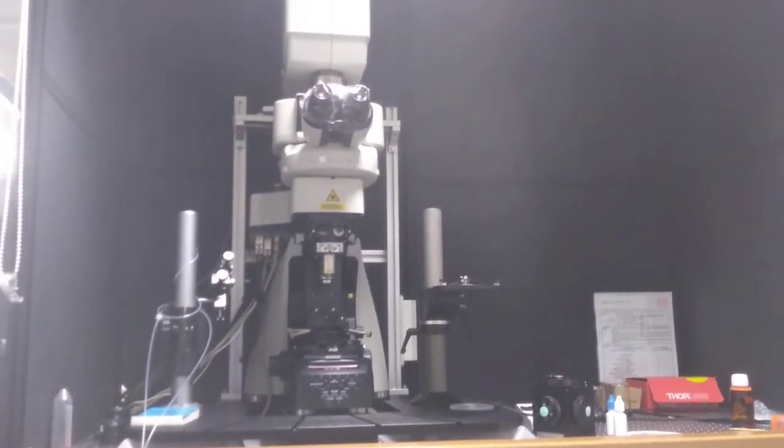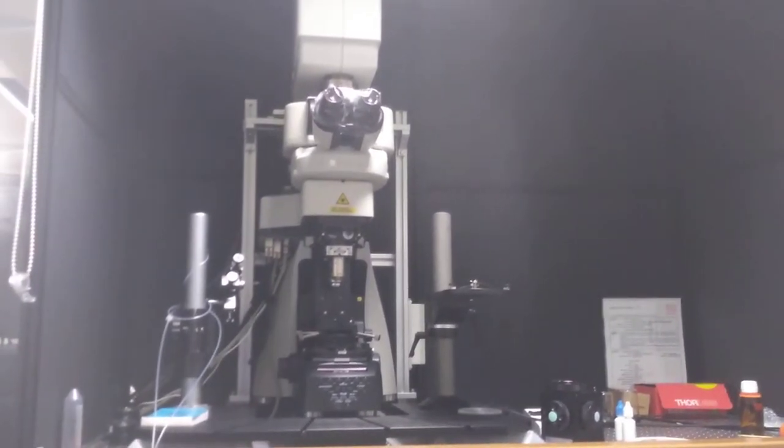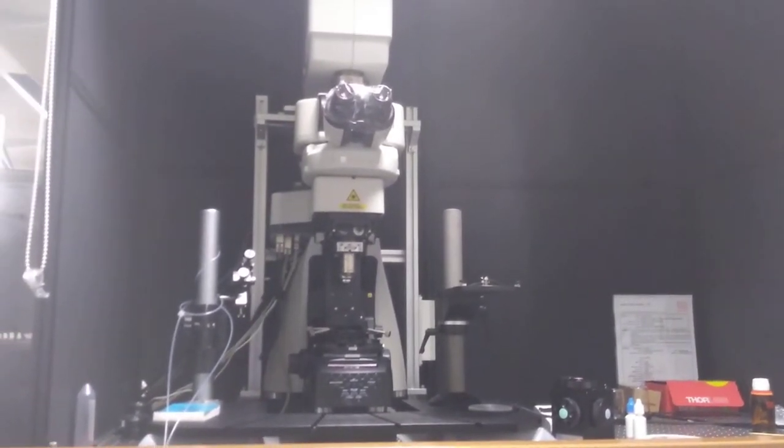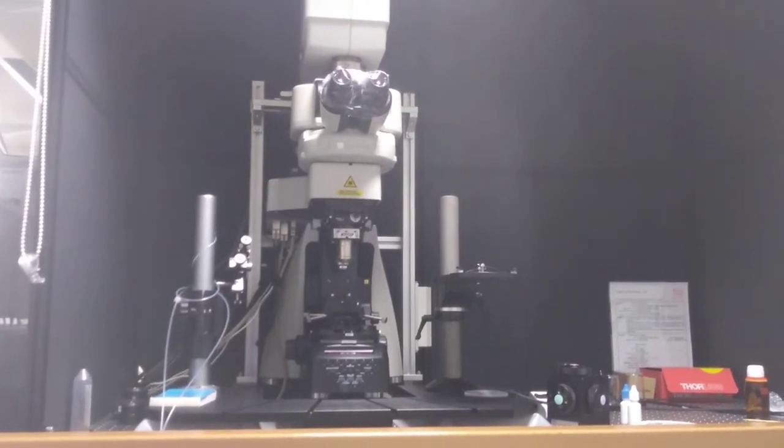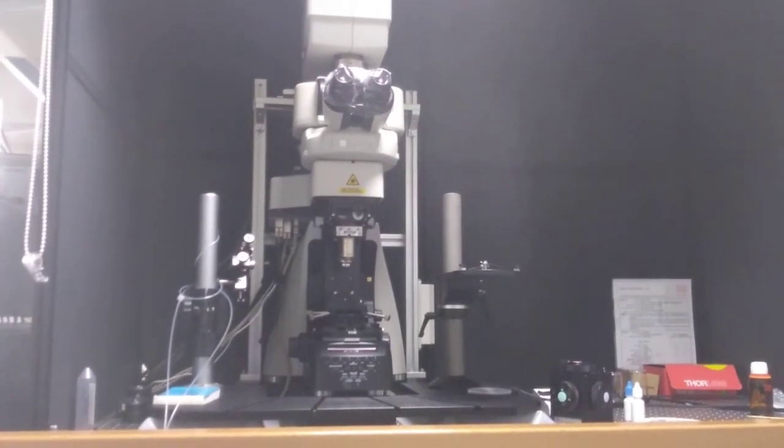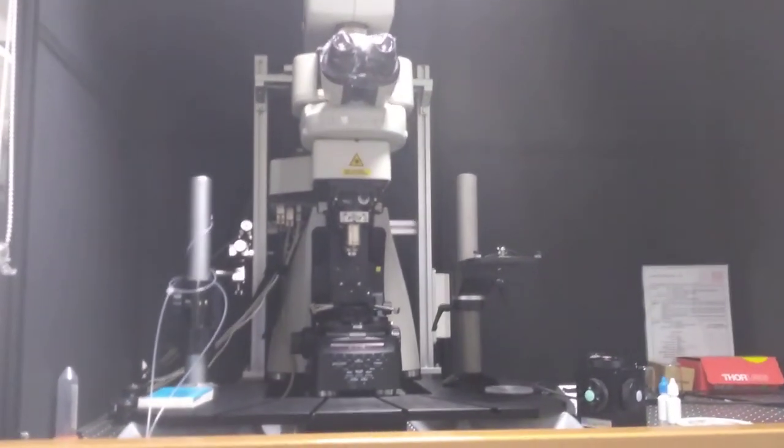Hello, this is a short instructional video on how to turn on the upright confocal or multi-photon microscope at the wall cellular imaging centre.